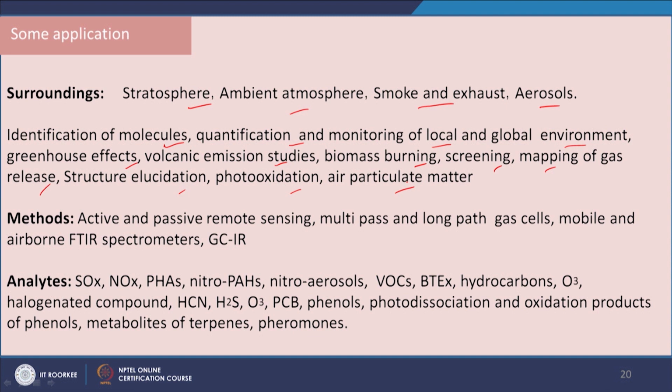These can also be analyzed, and methods include active and passive remote sensing, multi-pass and long path gas cells, mobile and airborne FTIR spectrometers, and gas chromatography, infrared spectroscopy.